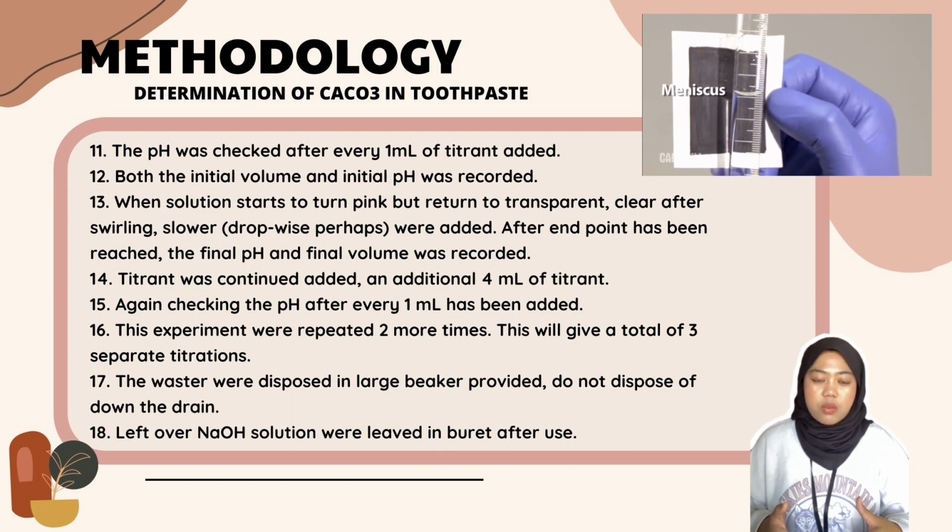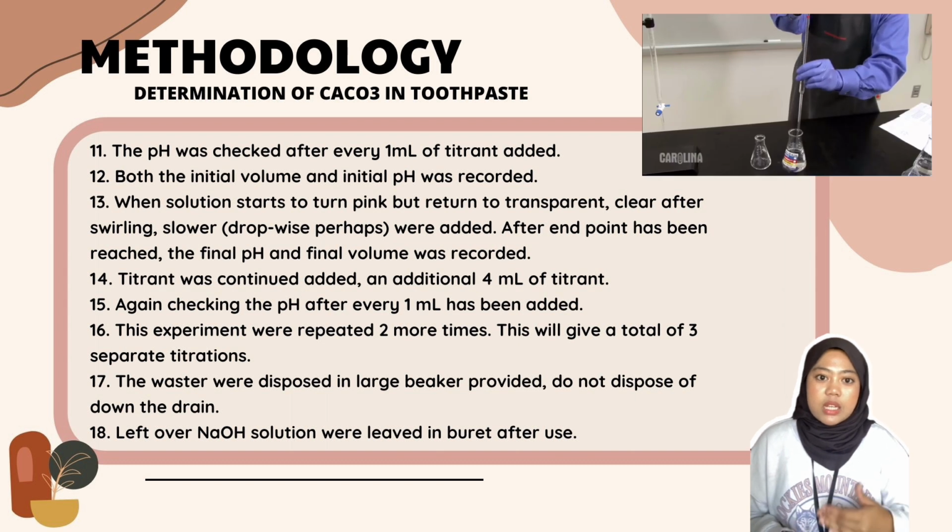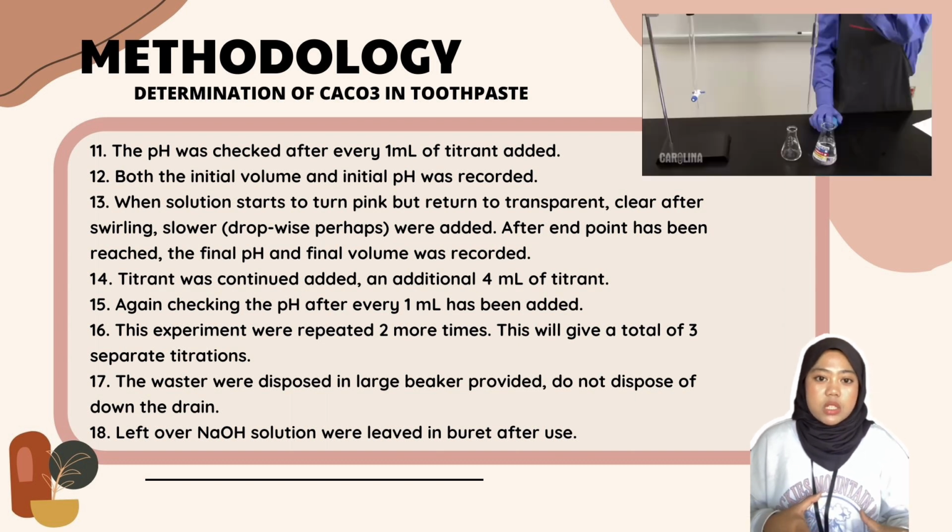And then next, when the solution starts to turn pink but returns to transparent, clear after swirling, slower, drop-wise additions were made.